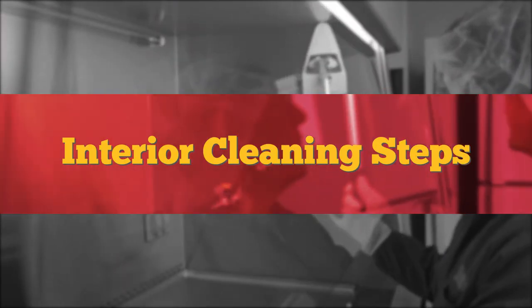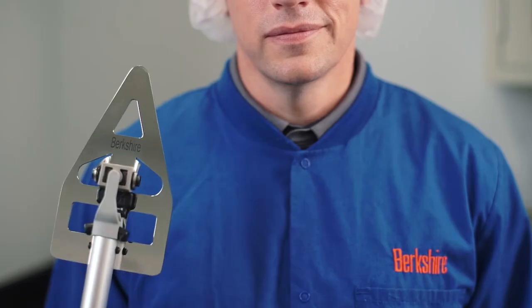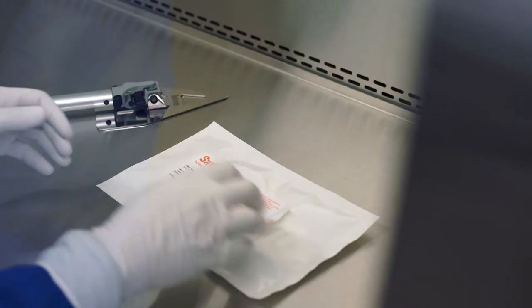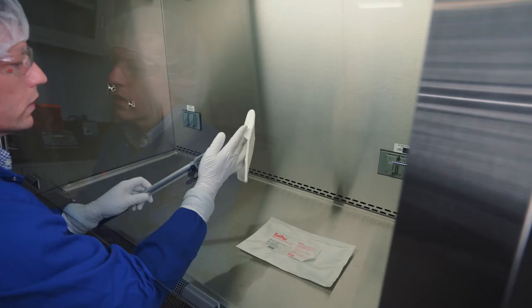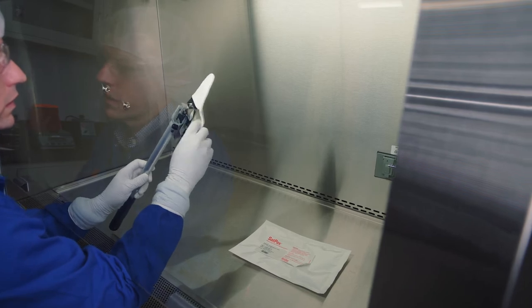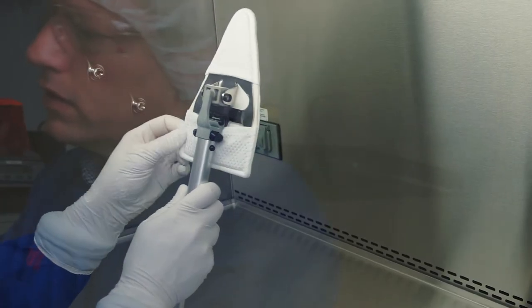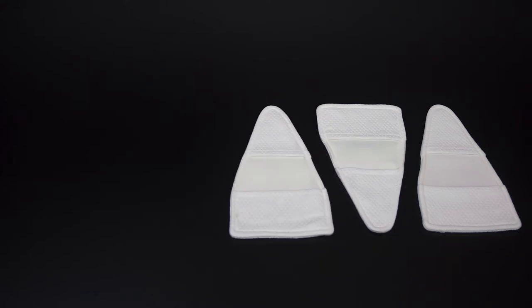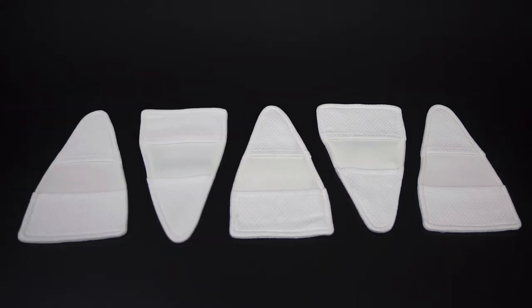Interior cleaning steps. Use the autoclavable EasyClean 360 tool and a sterile padded cover pre-saturated with isopropyl alcohol, IPA, and deionized water. Use one padded cover per interior surface, at least five covers, in the following recommended order.